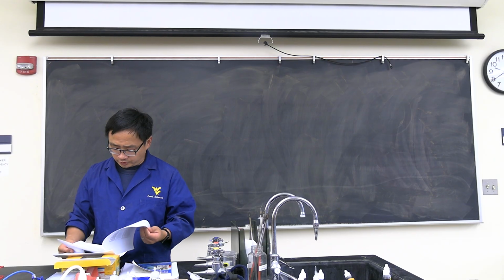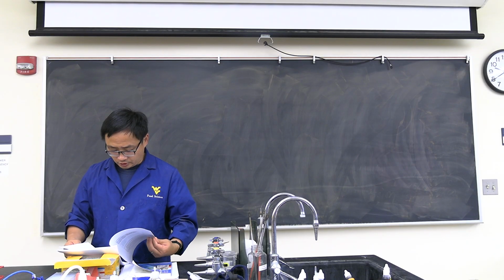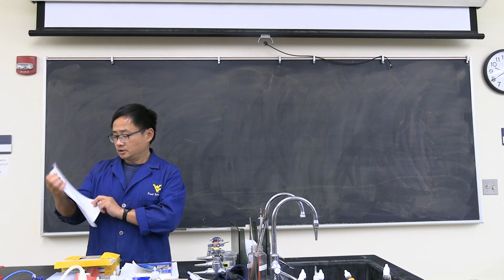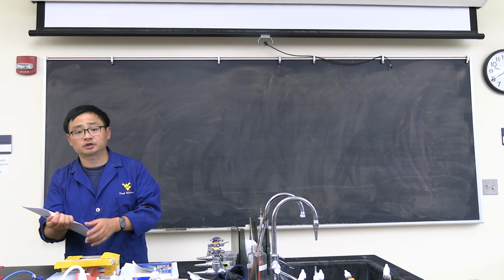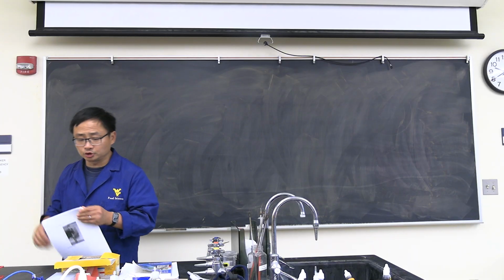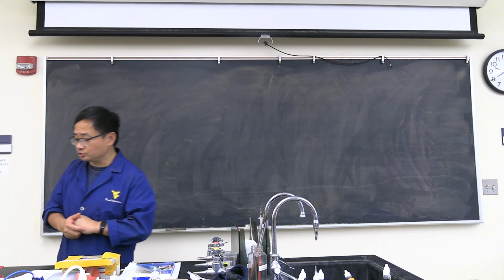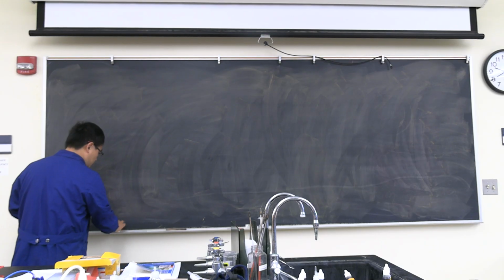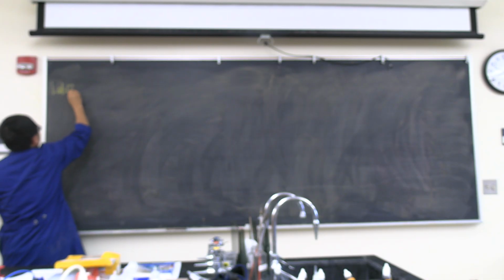So what we're going to talk about today starts from chapter 16 right here. We're going to talk about most of these tests except the nitrate reduction. We're not going to do that one. But most of the others we will do. Today, basically, we do the inoculation, and next week, Tuesday, we will do the confirmation. Okay? So that being said, I think it's lab 12.